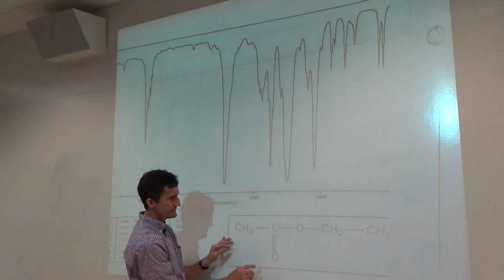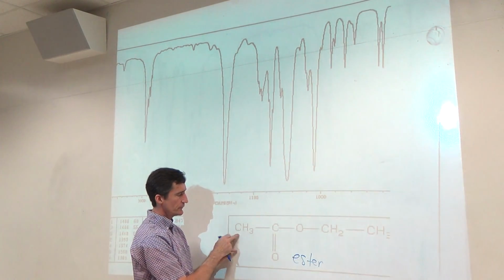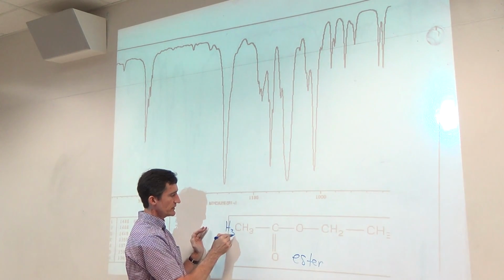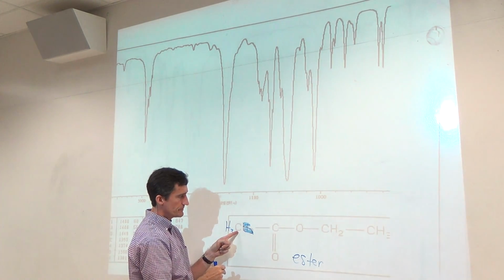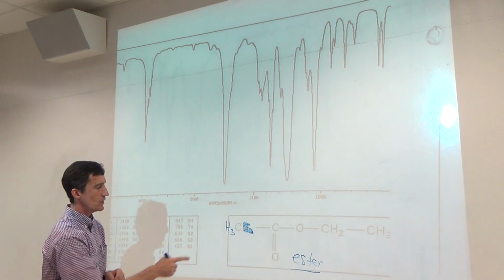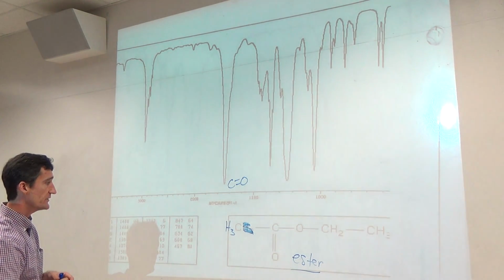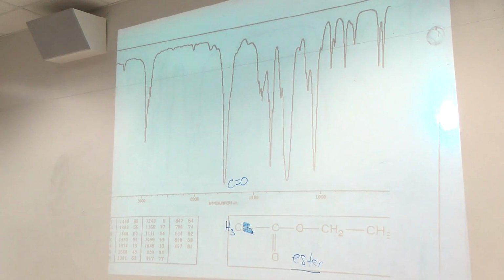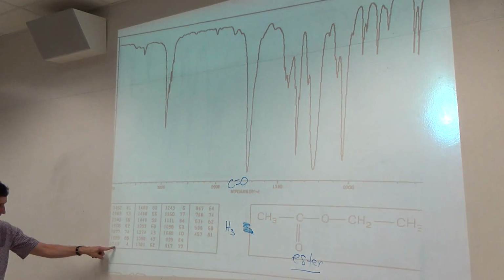In this example, we have an ester. Okay? Carbonyl bonded to carbon on one side. Of course, it's bonded to the carbon. A lot of times this will be shown like this. Sometimes it's better to show the H's on the outside, so you can see the carbon-carbon bond. Carbonyl, carbon on one side, O carbon on the other, ester. Carbonyl, there you go. If you remember, esters are a touch higher than standard. Instead of 1720, more like about 1743.